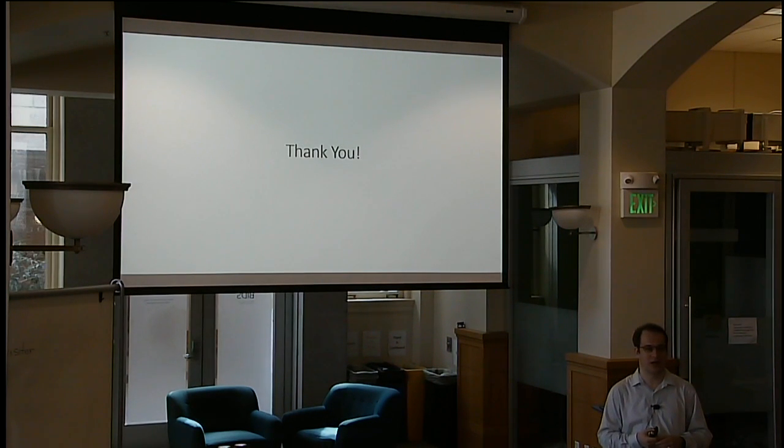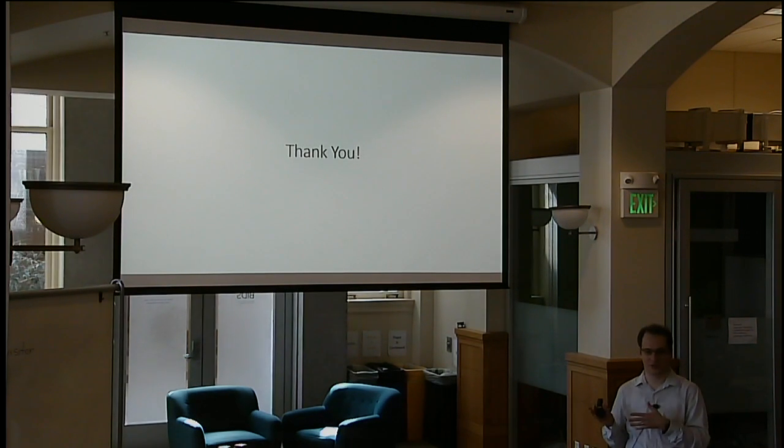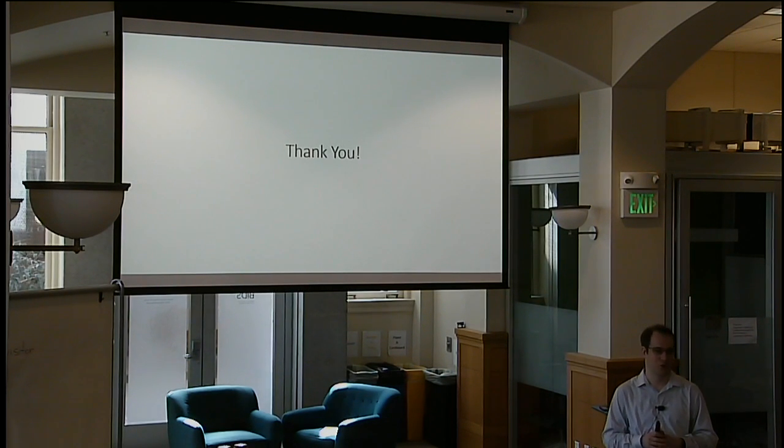Because we're interested in learning these bond lengths and bond angles, for that purpose we tested it on the known defects. It works well, and so this is enough pixel resolution for this type of problem that we're dealing with. That being said, yes, that is something that we need to consider. It works for the specific type of problems that we are working on, but there will potentially be some images that the model will fail to analyze, let's say too large or too small. Actually, too small is not a big problem, you can do it manually, but too large, right?